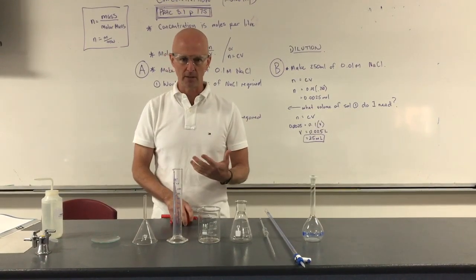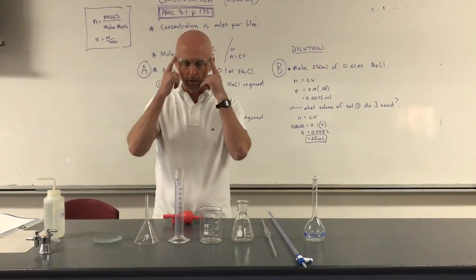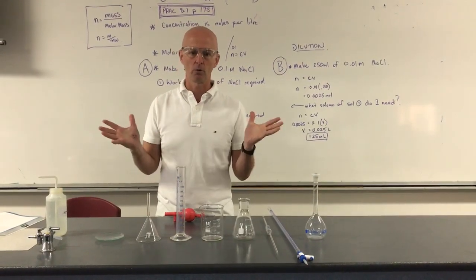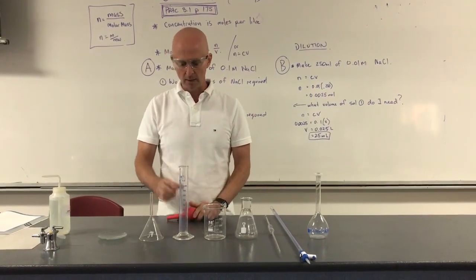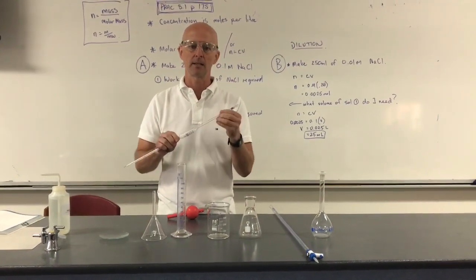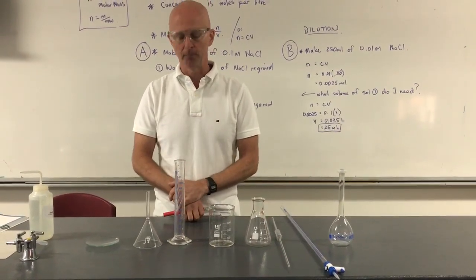So first of all, safety. Whenever we're dealing with any glassware, even without toxic solutions or anything like that, we're always wearing our safety goggles, because you can drop this, you can get shards of glass up into your face. So goggles are our default for any prac that we do. The other thing is you want to be really careful. We do see cuts with these things as people manipulate these and they snap and break. They're quite thin and dangerous. So you want to take care and respect the equipment.